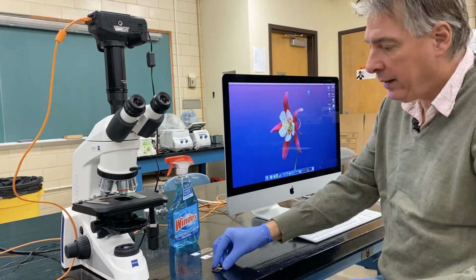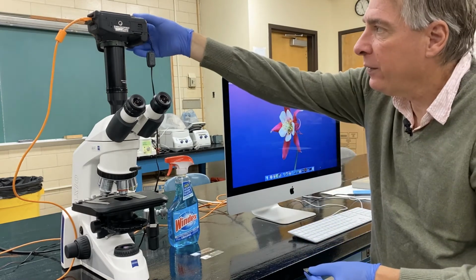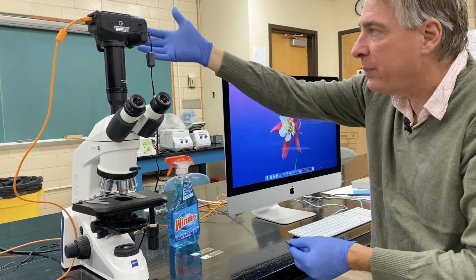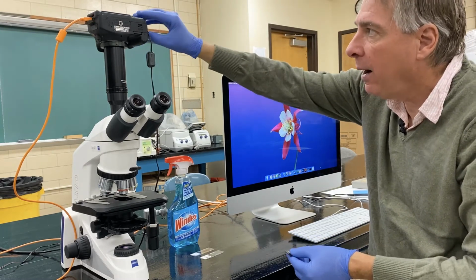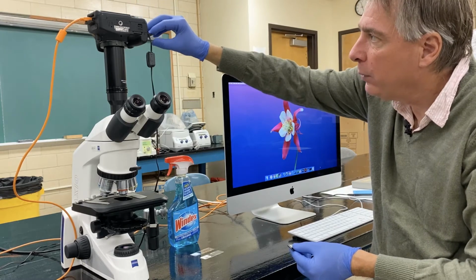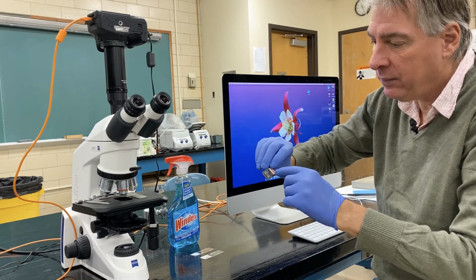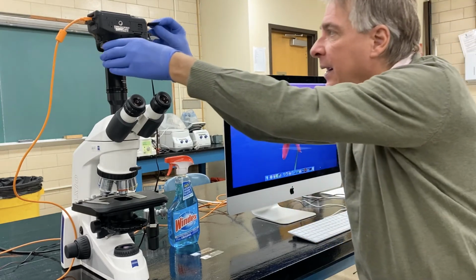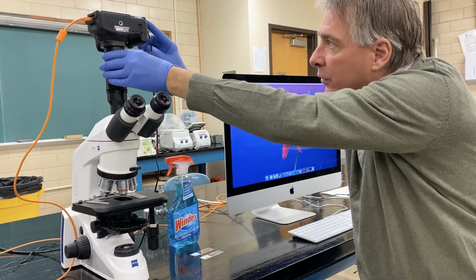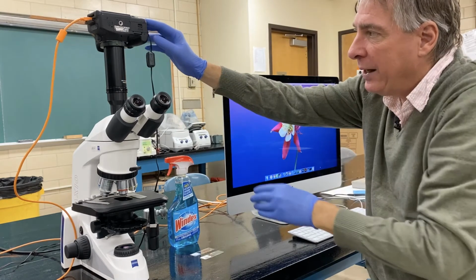Then we have to put in our SD card into the camera, and first you should make sure that the camera's off. You never want to put the SD card in the camera while it's powered up. The camera is indeed off. I'm going to lift up on the door and then pull it open on the hinge, and we want to put the SD card in label side up into the camera. Then we lift the door back up and pop it in place by pressing down gently.